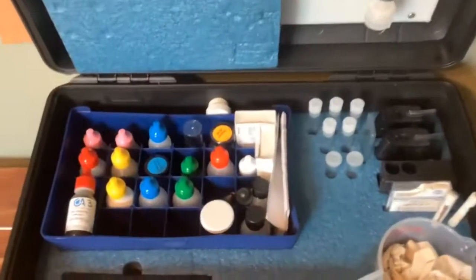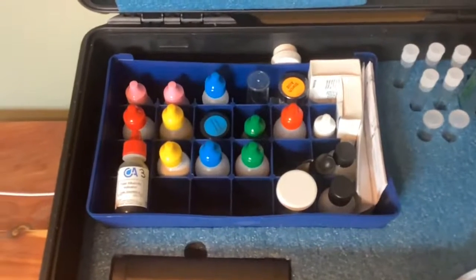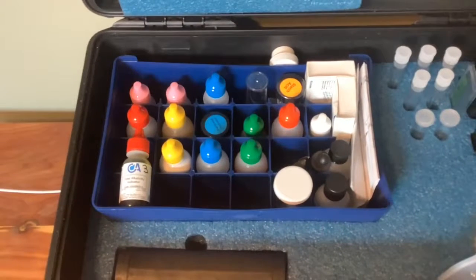Let's move on to the test kit. Every water treater will receive a test kit that will look similar to this one in the video. It is very important to keep a clean and organized test kit. This kit has each bottle lined up in order of specific tests to ensure quick and efficient work.